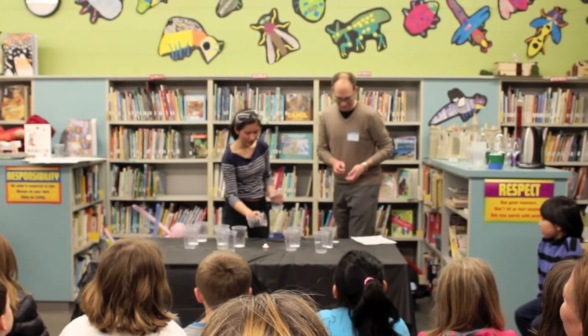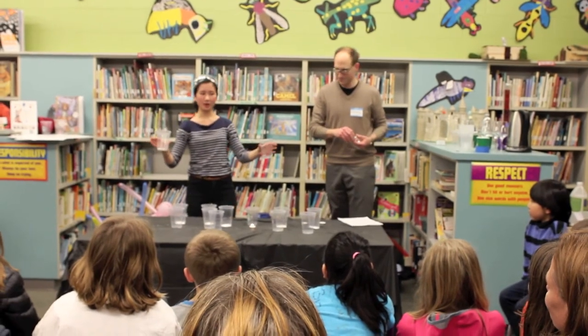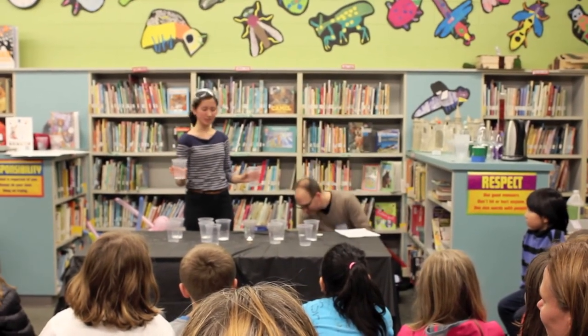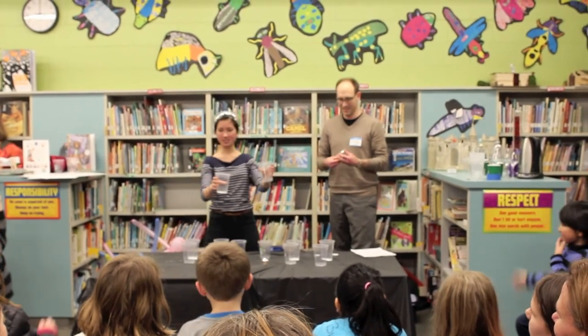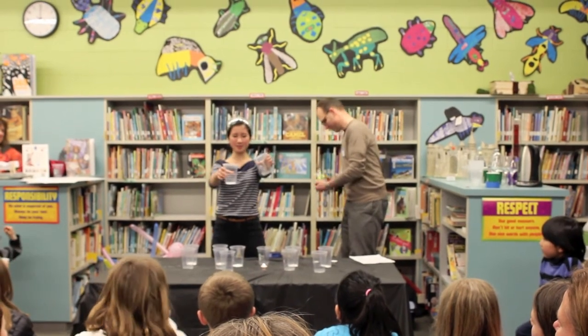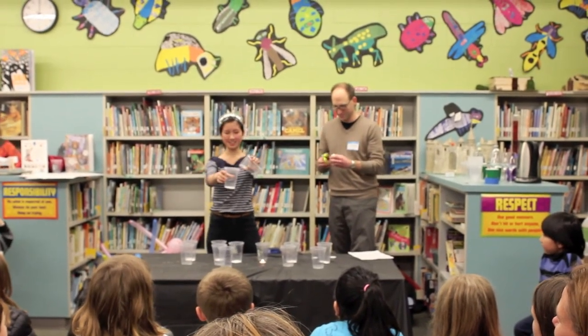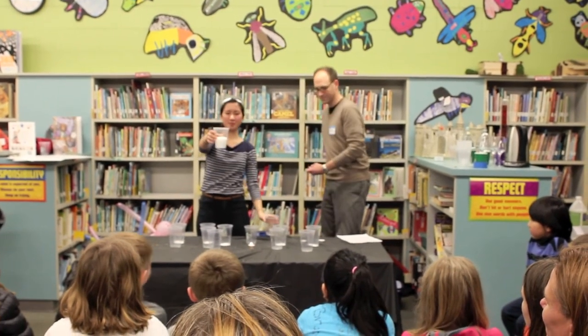Okay, same empty cup, nothing happens when you pour it on. So what I'm going to do, also watch carefully because we're going to ask for 4 or 5 volunteers after this to do the experiment. So watch us do it first and then you guys can do it yourselves. Okay, so on the count of 3, I'm going to pour it in. Ready? 1, 2, 3. So there are some bubbles.